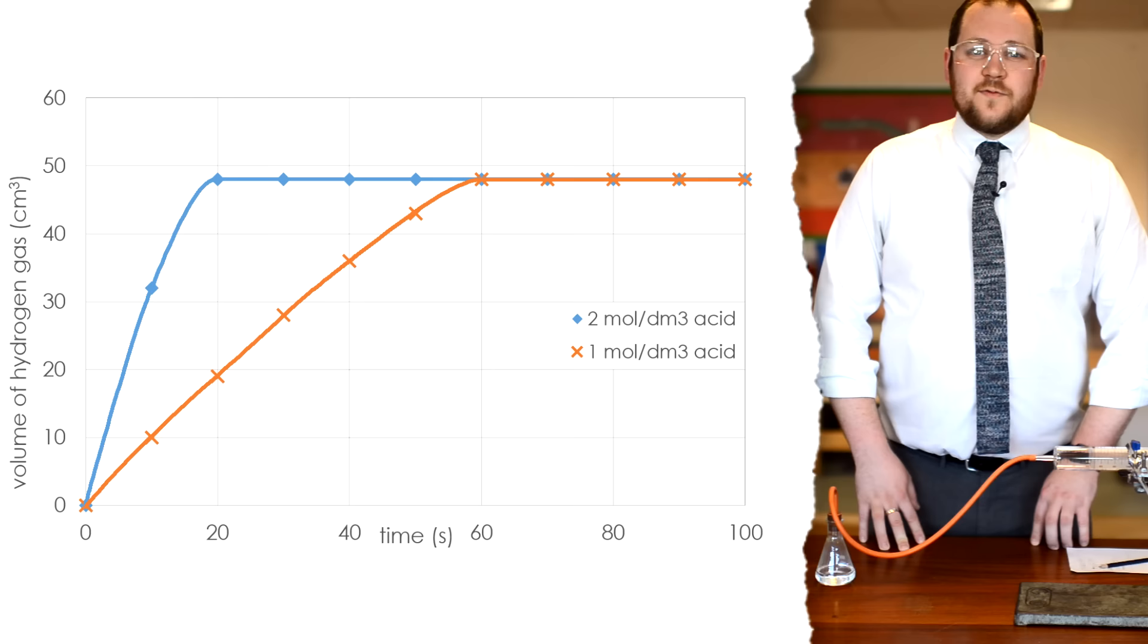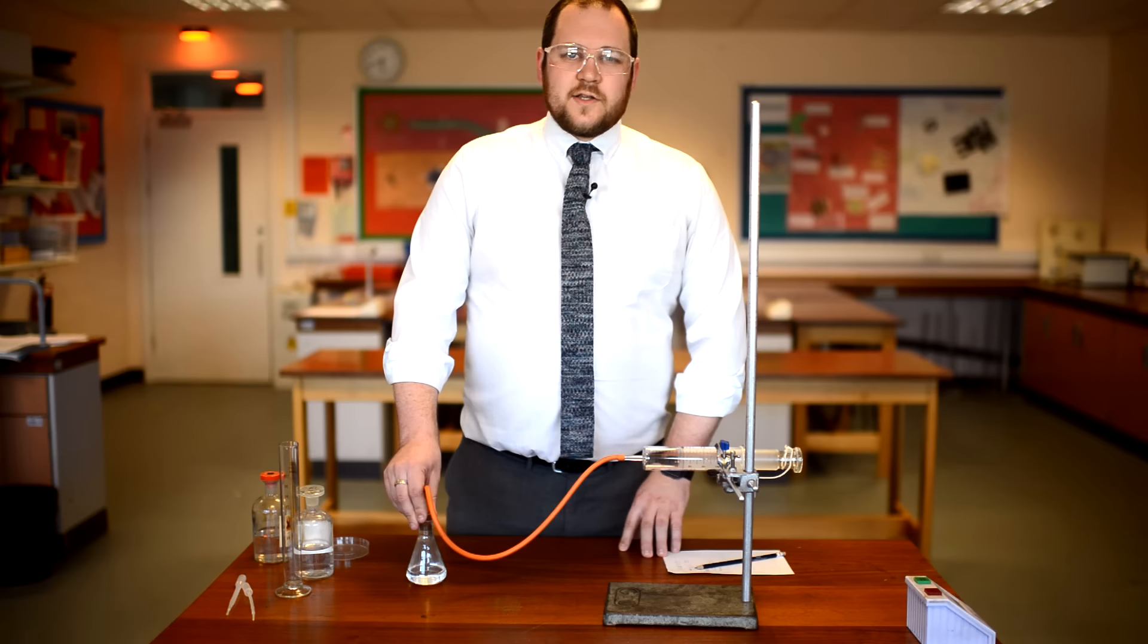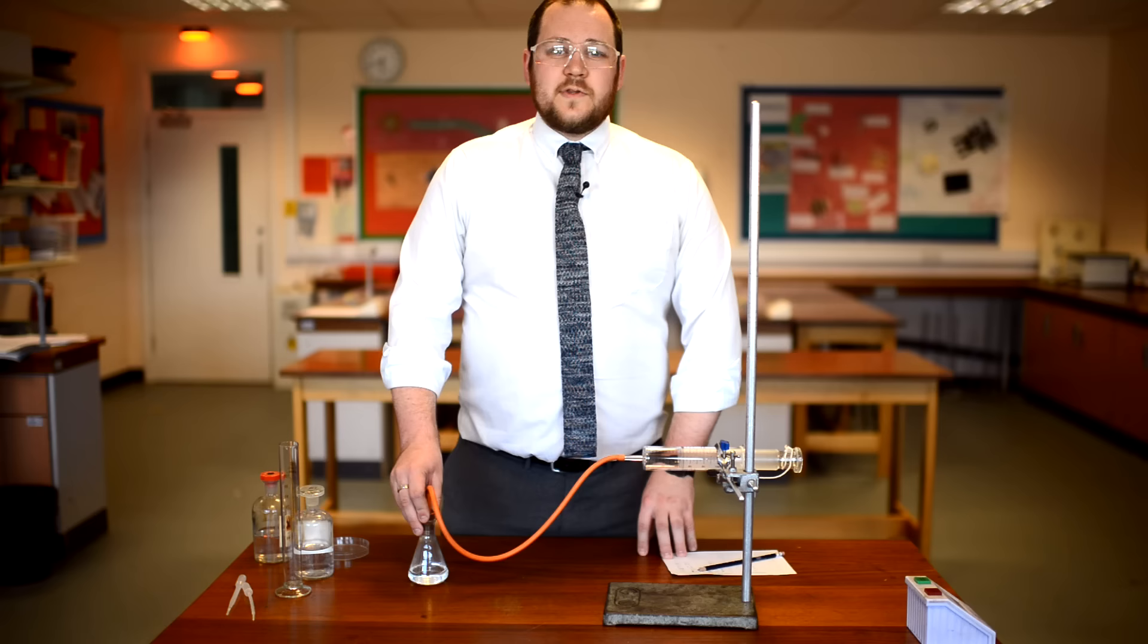There are some sources of error to be aware of in this reaction. Firstly, the fact that we are starting the timer, putting the bung in the conical flask and adding the magnesium all at the same time is impossible. This means it's a good idea to have you and a partner doing this reaction as it would be very difficult on your own.